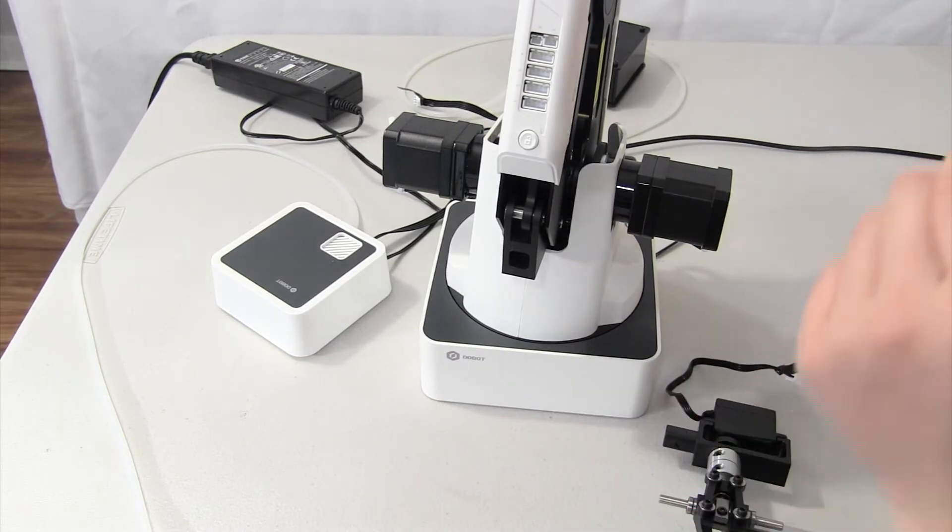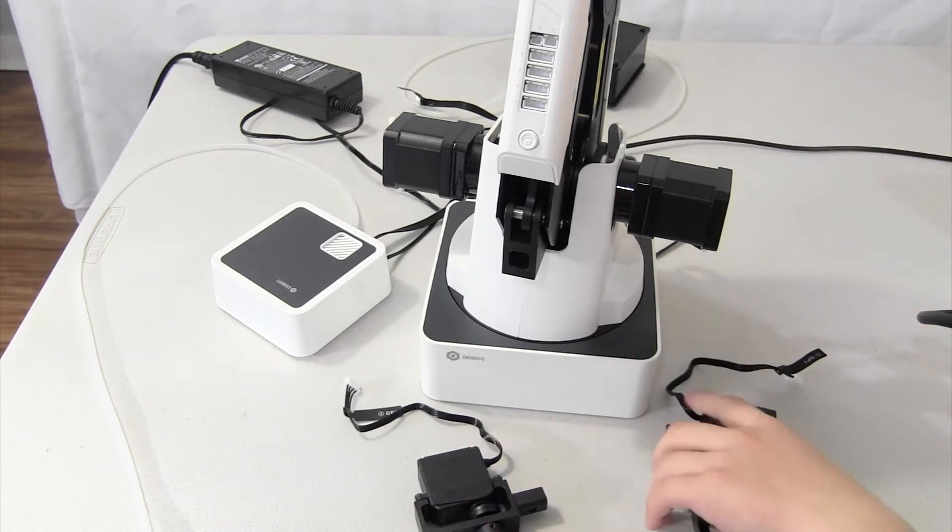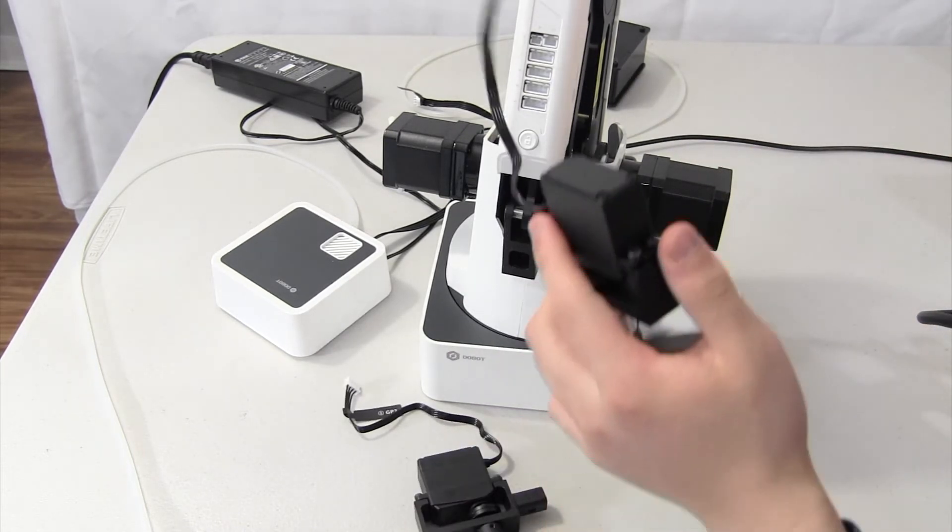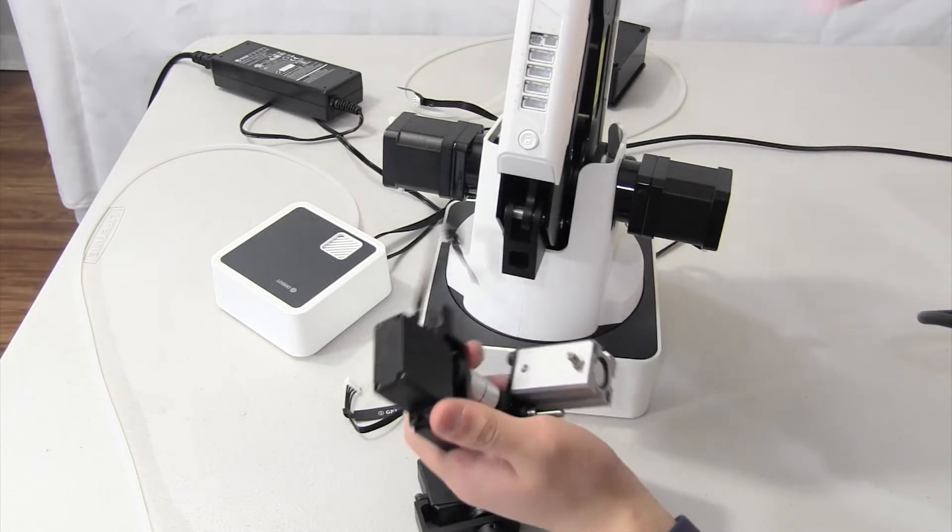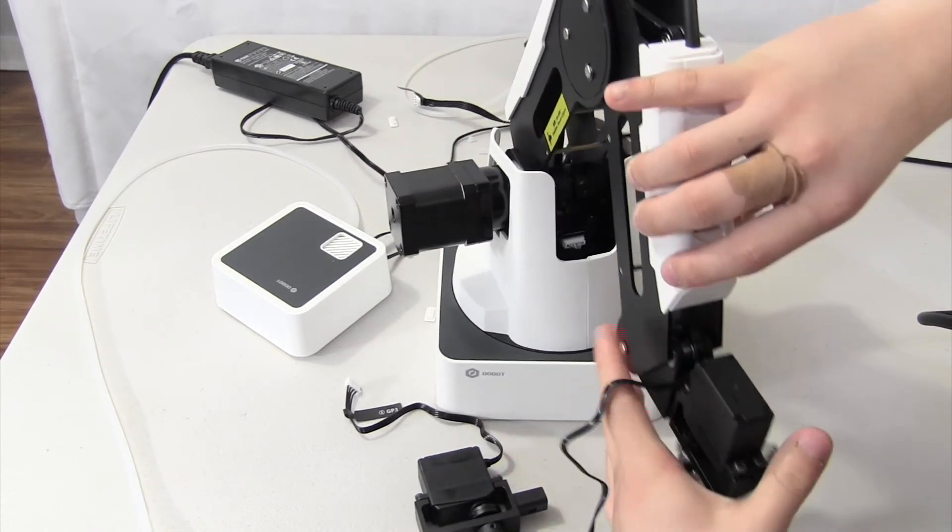And once you've taken out that screw, that just easily slips off. You can put this on and it automatically works and now, let's put it on.